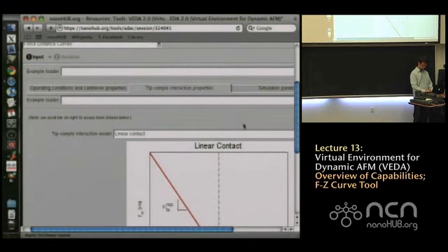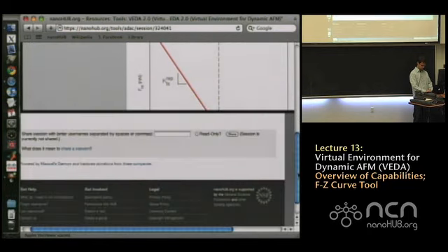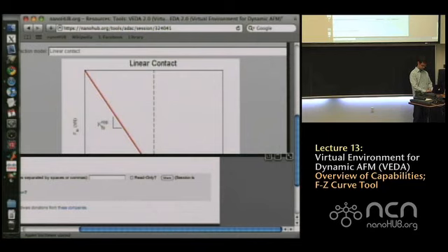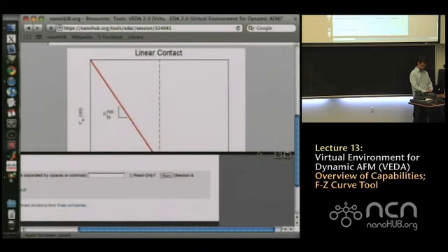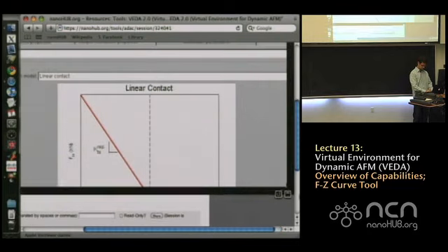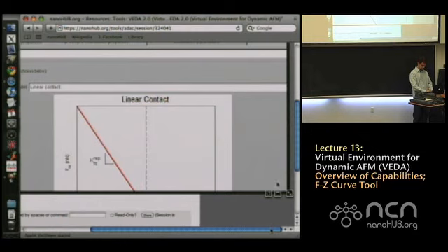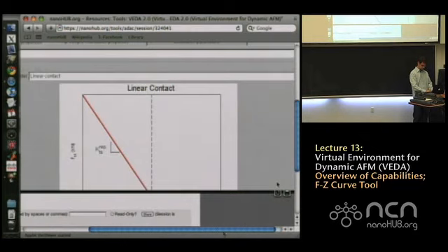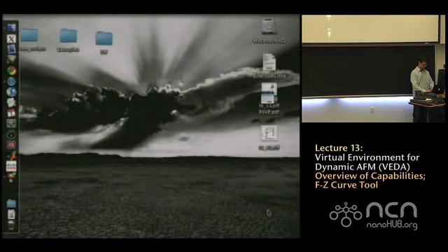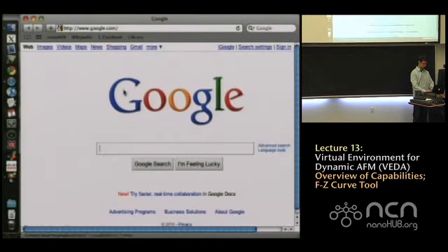In those cases, the force distance curve can pretty much be modeled as a contact spring. You don't need to worry about the 3/2 power relationships. A virus capsid is something like that. It's actually like a balloon, if you will. The wall is very thin, and you're pressing down on a shell or a wall. In these cases, the spring constant is a good representation of the force distance. So very simple, you just model what you're pressing as a spring. Okay?